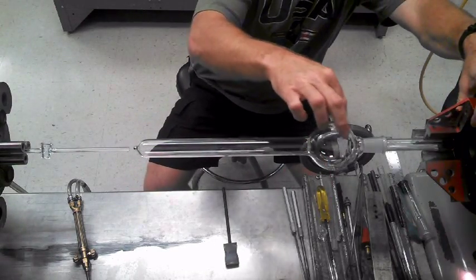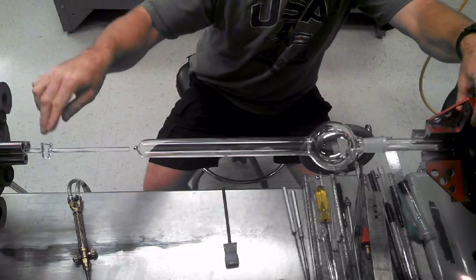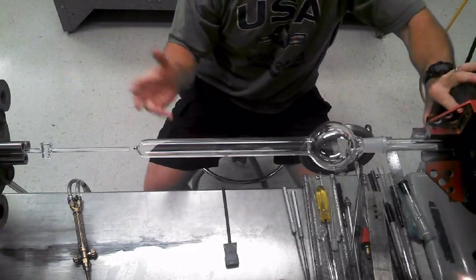Usually what I do, I look for my decal on here, then I line my stop cock off it. But I don't have a decal so I'm not worried about that.